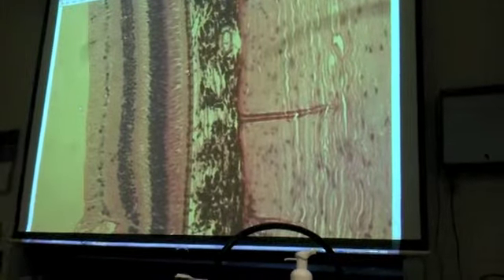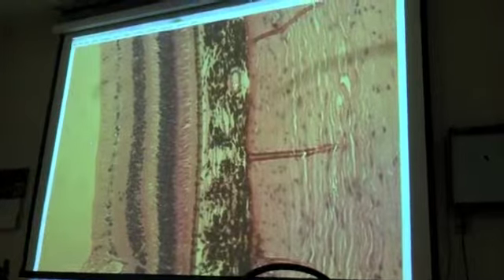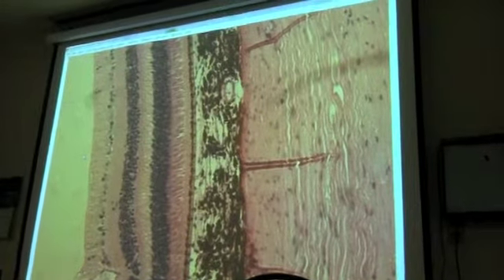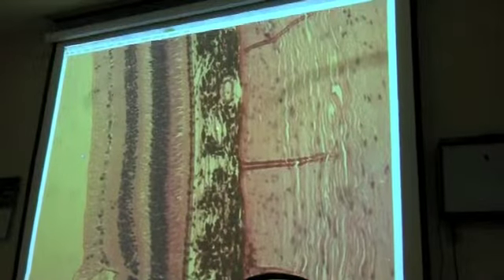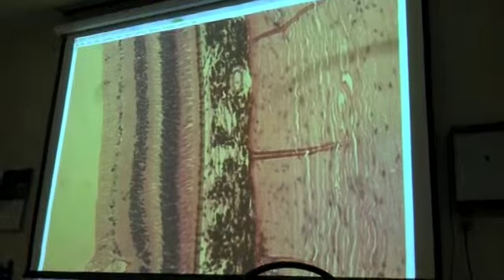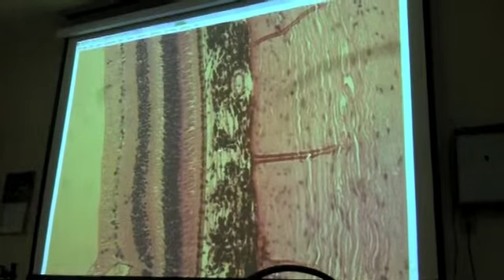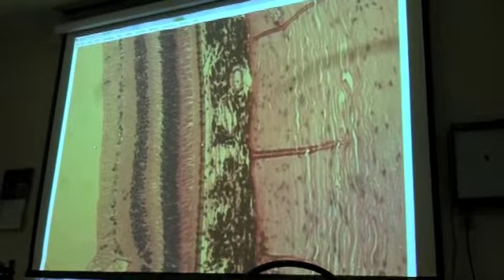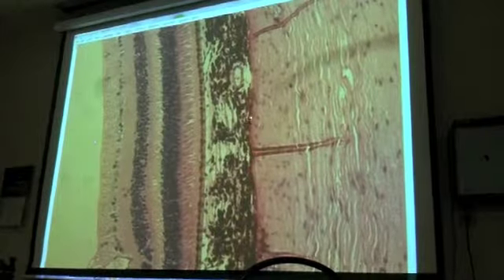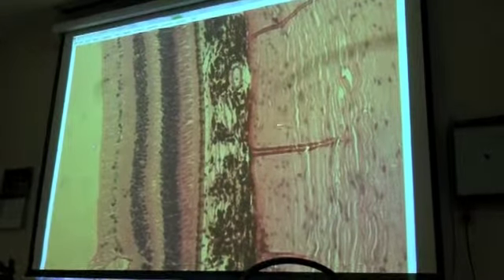Now that pigment is the same as the pigment back here in the choroid. Here's a blood vessel. So the choroid is part of the middle vascular tunic, and these are blood vessels in that vascular tunic supplying the eye with blood. So the choroid is a lot thicker with the brown pigment than this pigmented layer of the retina right here. And then posterior to that, the fibrous connective tissue is the sclera.